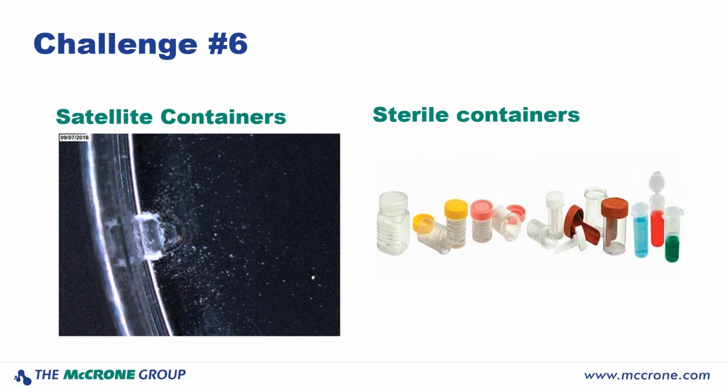Every surface where the plastic bottom meets the top, every time it touches against each other, it's shaving off these microscopic particles. And these run the risk of getting on any sample that is contained in the Petri dish. But likewise, any sample put in the Petri dish could be shedding particulate into the dish itself. So at the end, you don't know. You don't know if the particle stayed where you put it, if the particles from the Petri dish wound up on your sample, or vice versa. This can create a perfect storm of confusion for what you're looking for.